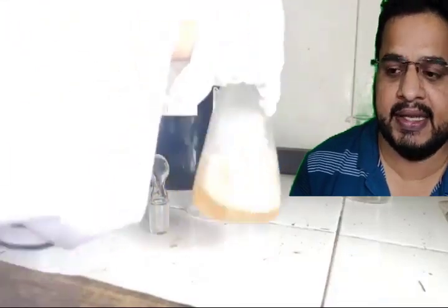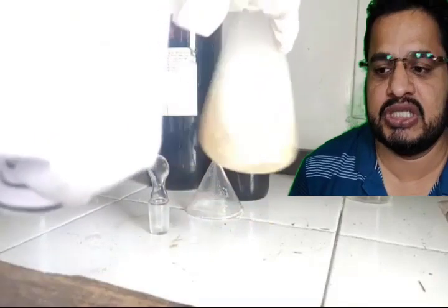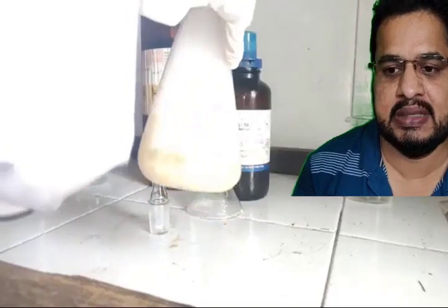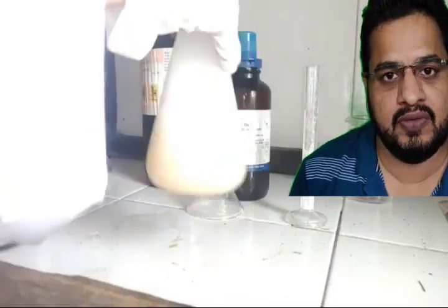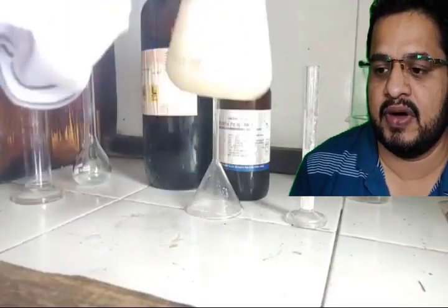Once we add the benzoyl chloride, we will stopper the flask and then shake it vigorously, and this shaking we will continue for 15 minutes. See the fumes inside; all fumes should settle, and that would be the indication that the reaction is completed. Now I have shaken this flask for around 15 minutes.